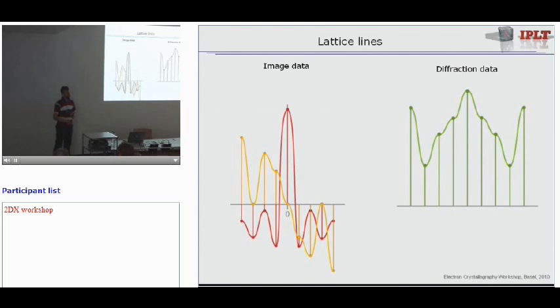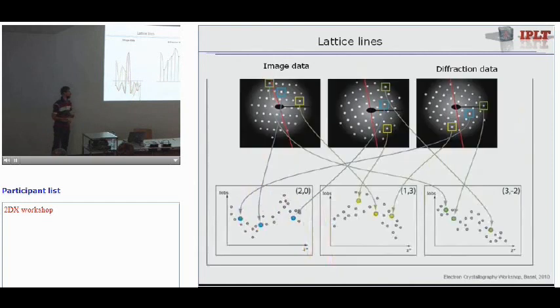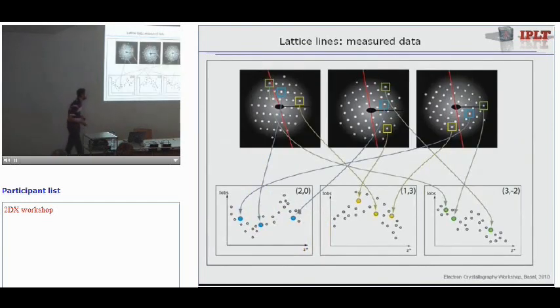So you cannot directly go back from diffraction data to real space and get an image. This also means that in the end you have to get some phase information from somewhere, either by molecular replacement, as Rich will show you later on, or by recording an image data set and getting image phase from there. And the other thing is, that's also true for amplitudes, you get a data set which is always positive. So your amplitudes or your intensities you measure should never be negative.